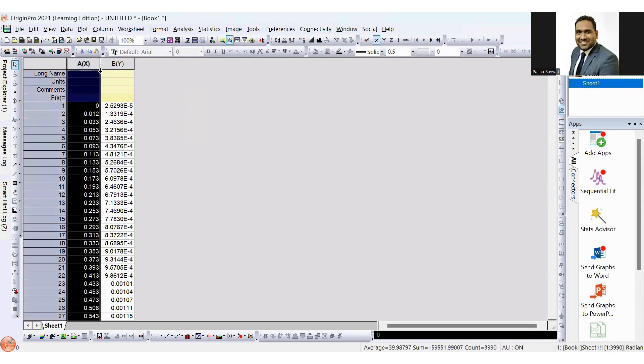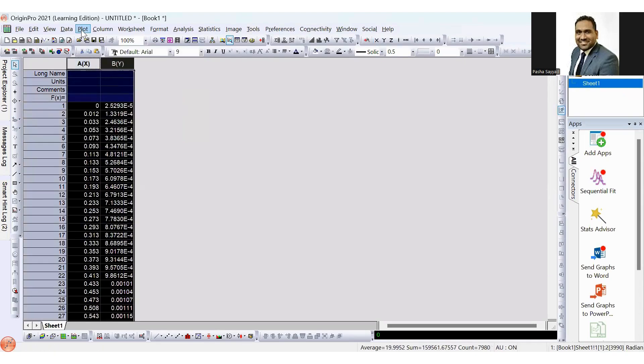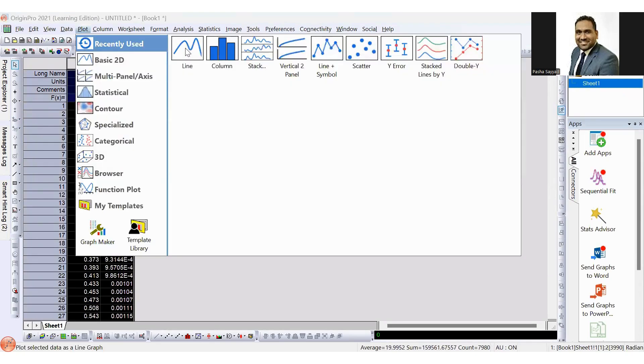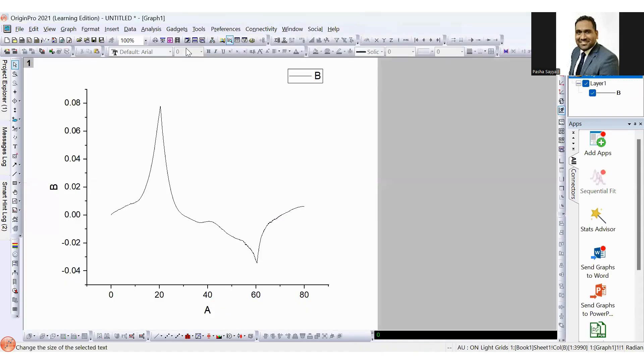Select the X and Y axis and plot the line graph. Once you get this line graph, now let's calculate integral.